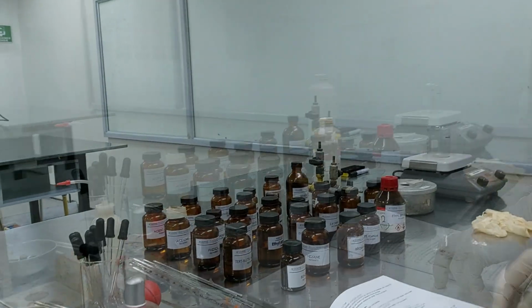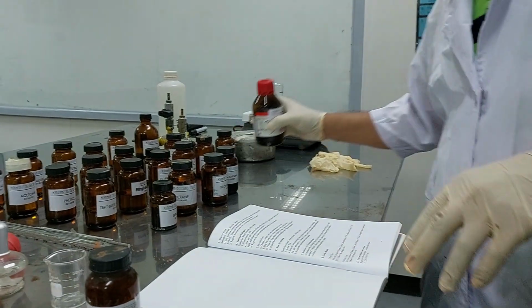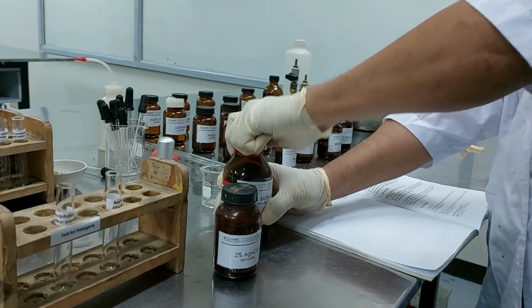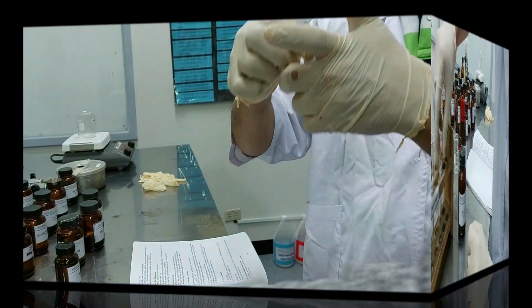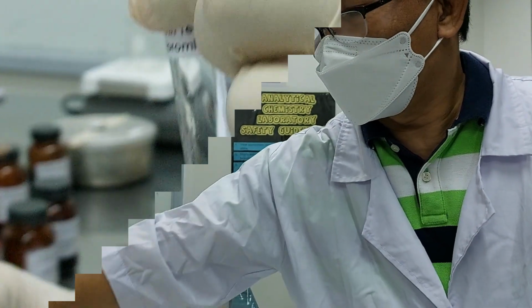Okay, this is silver nitrate, no? And then we have ethyl bromide. So where is ethyl bromide? There. Okay, so this is ethyl bromide. So we have now the complete reagent. So you just have to place a few drops. So you have now ethyl bromide, no? And we're going to react this with silver nitrate. So we have to swirl.